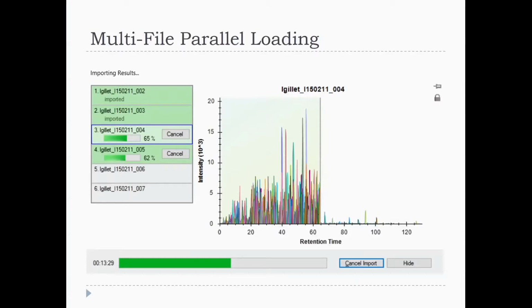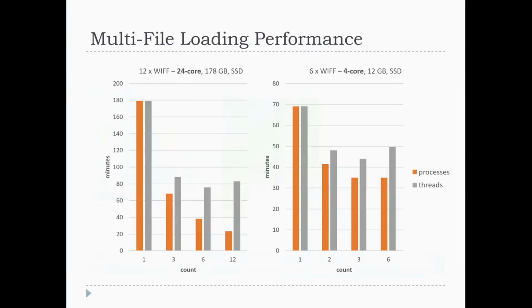Okay, and so then, we did a huge amount of performance work to get this working because we just had not been working with data sets this big. We did this multi-file parallel importing, which you'll get to do today, later, as soon as I get done. And then I did a lot of analysis of how to make Skyline fast, and my mantra was, if you pay for computing power, you should be able to use it with Skyline.